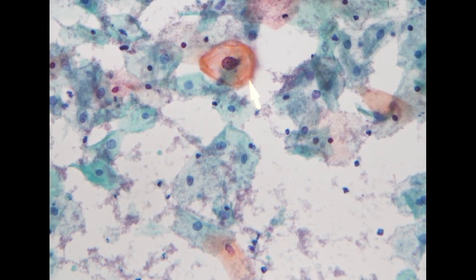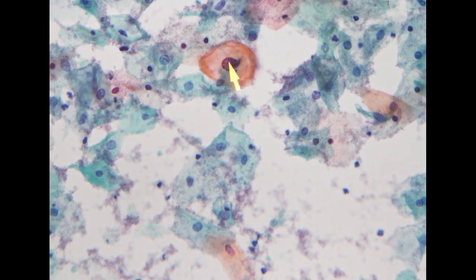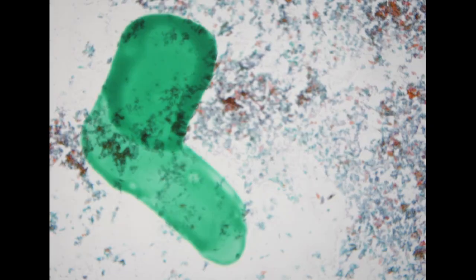So here we see a superficial cell with enlarged nucleus. Comparing to the adjacent intermediate cell, it's a little bit hyperchromatic, but not that high. And it still maintains a low NC ratio. So the cell looks like ASCUS.